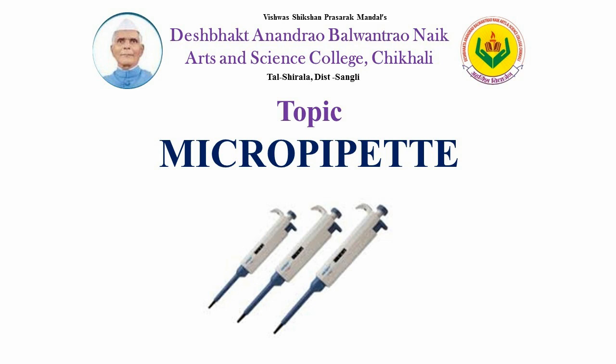Hello friends. Today's topic is micropipettes. Micropipettes play an important role in measuring and dispensing volume accurately.